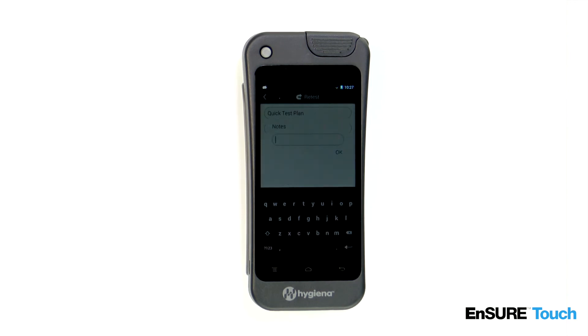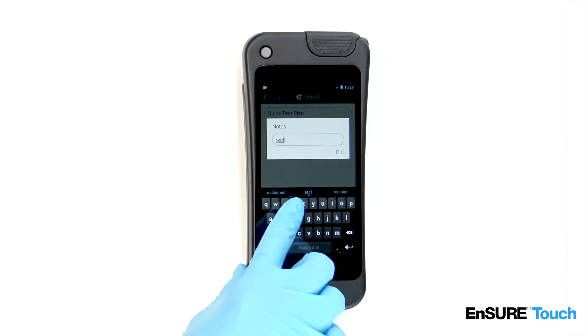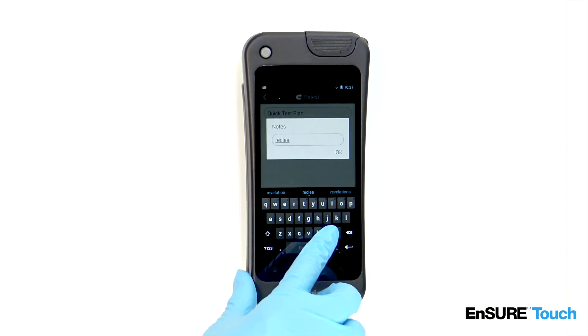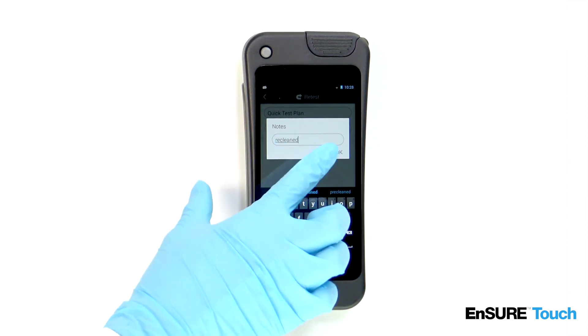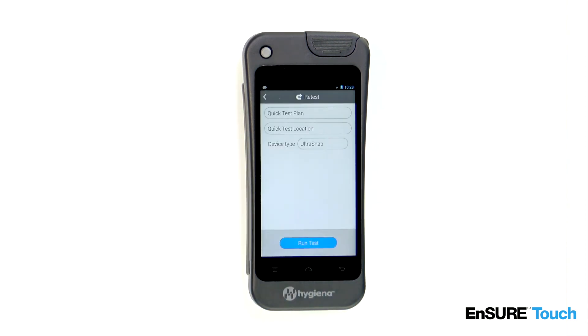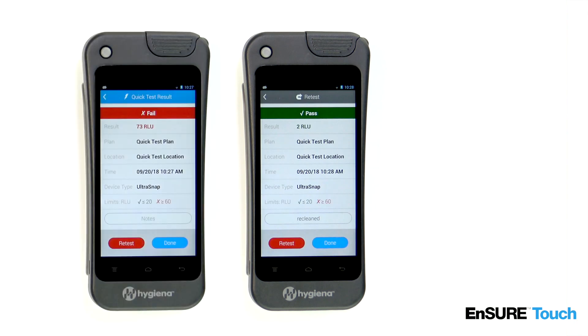Enter in any applicable notes. Touch run test. The retest result is matched with the original result that didn't pass, making it easy to prove that a corrective action took place.